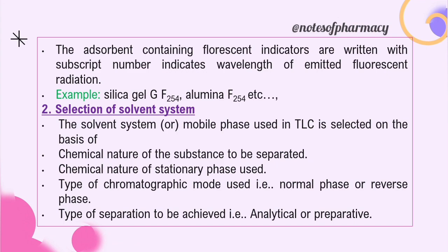The adsorbents containing fluorescent indicators are written with a subscript. The number indicates the wavelength of emitted fluorescent radiation. Silica gel G F254 and alumina F254 and so on.